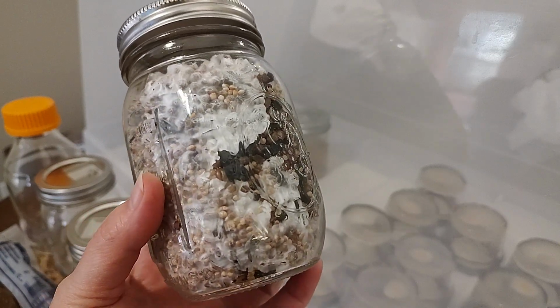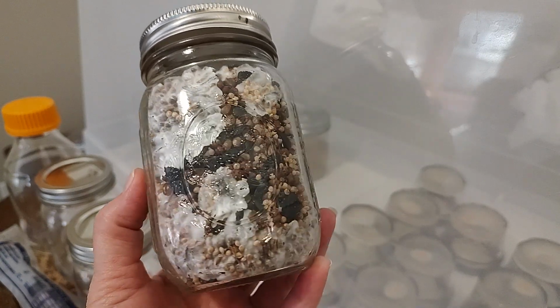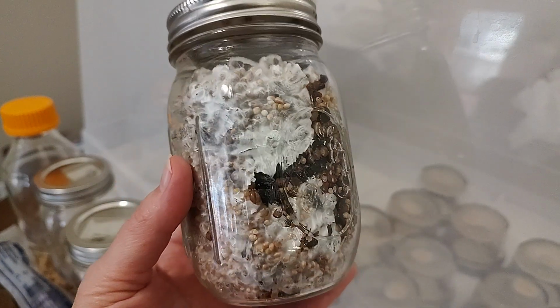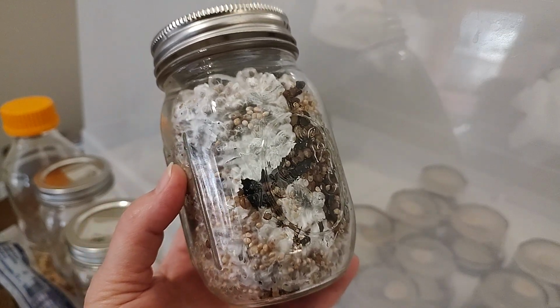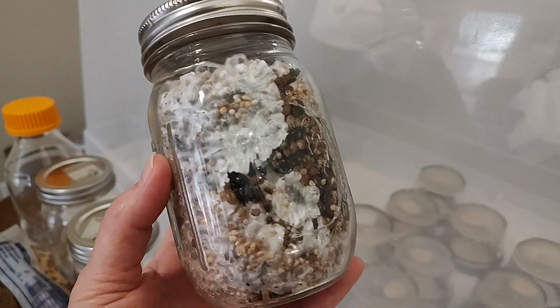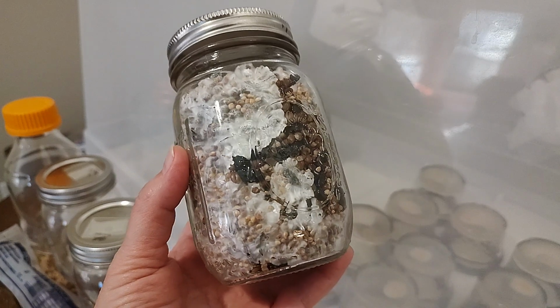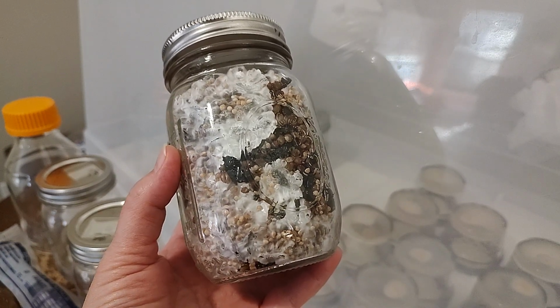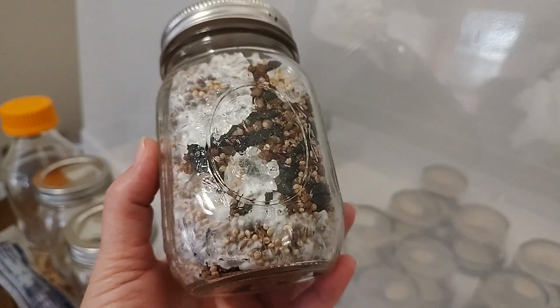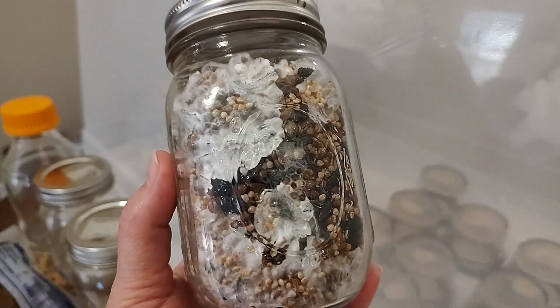What a spore will produce is really small, and when we grew from spores right off, it's not what we wanted. We were actually disappointed. I mean, we grew stuff, but not what we wanted. So when we switched over to embracing this idea of agar and liquid culture and mycelium and no more working with spores where we have to go through that germination, also the germination process is lengthy. The amount of time it takes a spore to germinate is quite a while. And your grain, your WBS, whatever it is that you're working with, a grain jar or a grain bag, can dry out. So you also open the door for some problems with working with spores.